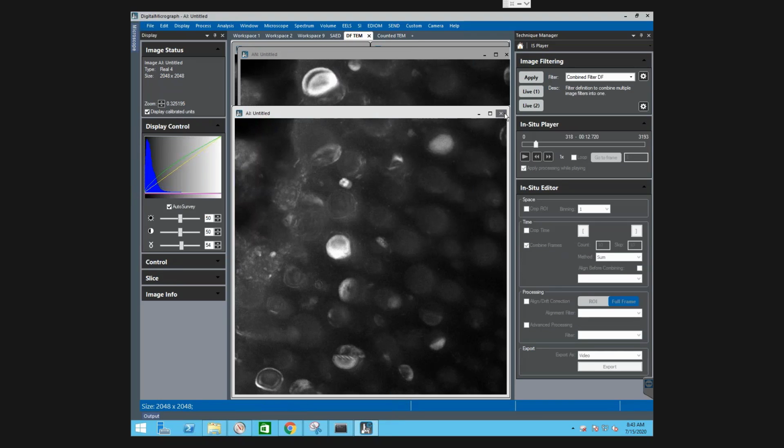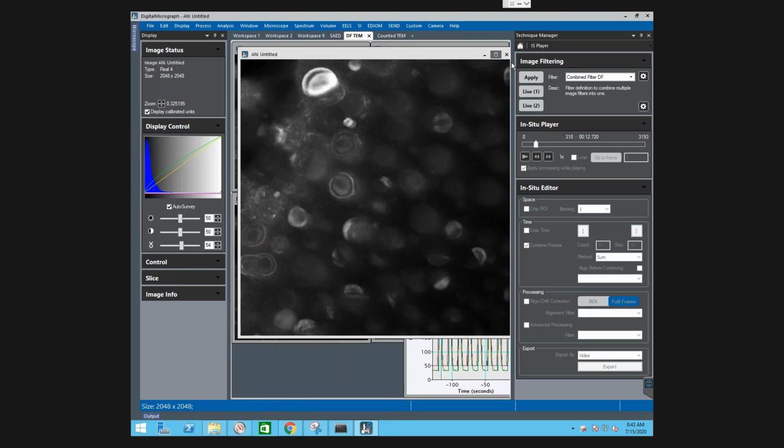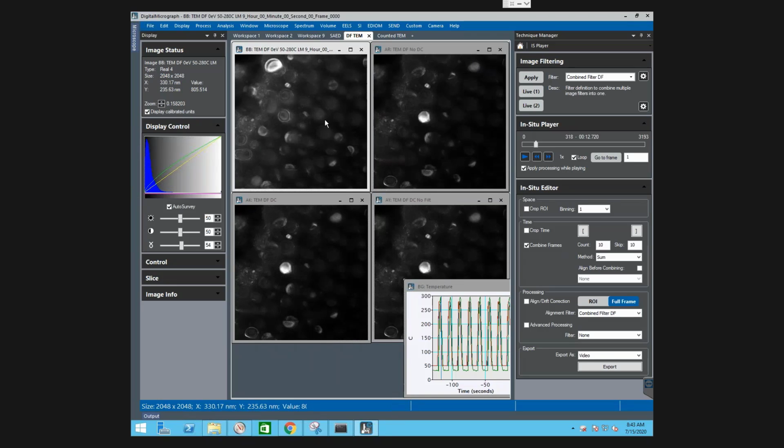For the sake of time, I'm not going to do that in detail right now. I already put together the filter and adjusted it just the way I wanted. And yeah, I wish I had 2 hours and could show you all of this in detail, but anyway, maybe another time.